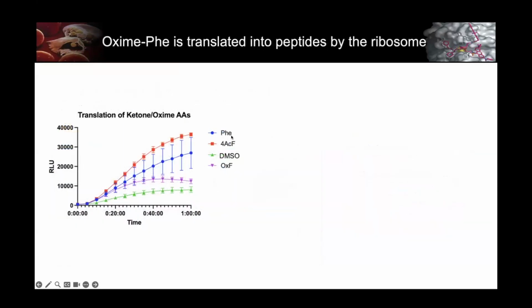So I did this analysis for mine. You can see here's phenylalanine in blue. That's the natural amino acid. It incorporates really nicely. If we put just a ketone on there, it's no problem. It incorporates. But amazingly, if you put that giant electrophile off of it, it still incorporates. You can see in purple. It's not as good as the natural amino acids, but it's quite good, and in fact good enough to do library screening. And you can confirm this by mass spec.